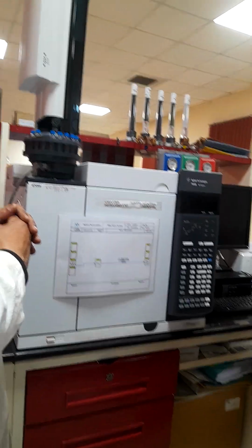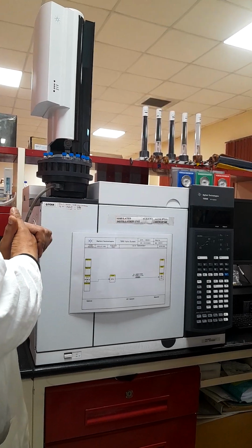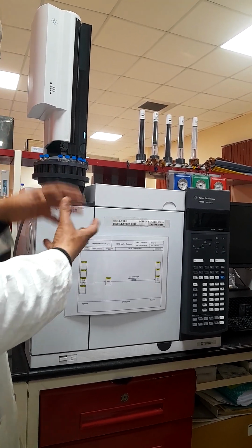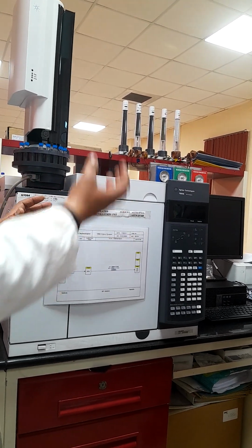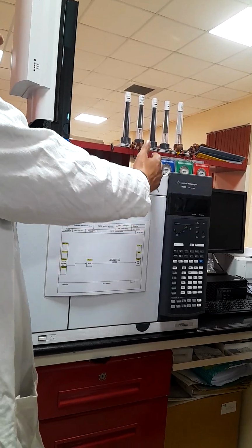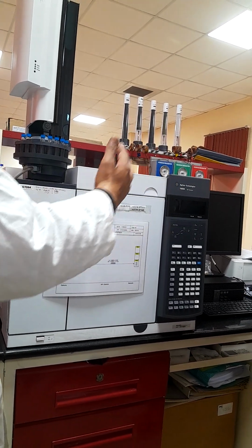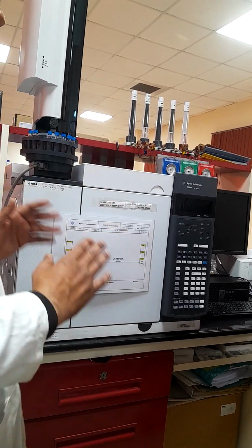It is a silicon polymer which has different polarity, and by this polarity each hydrocarbon gets attracted to these polar bonds and binds a little, not permanently, temporarily, on the surface of the PDMS molecule. According to their flow, the lighter will come first to the detector, then the higher, then the highest molecular weight hydrocarbon in the sample will reach the detector and get detected.